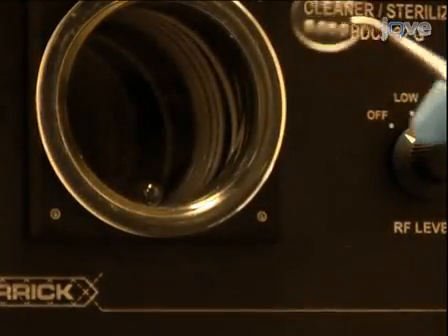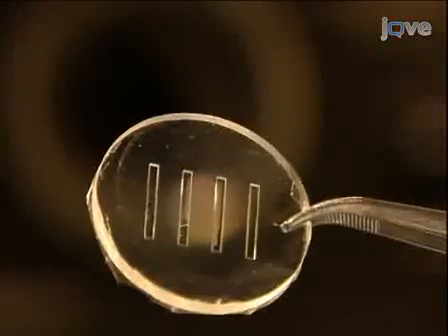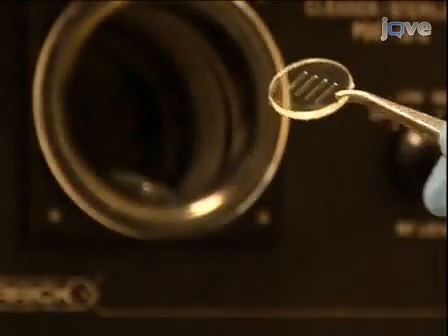Fuse the flat side of the PDMS disc, the side not containing the channels, onto a 1-inch glass window by plasma oxidizing both surfaces for 30 seconds.